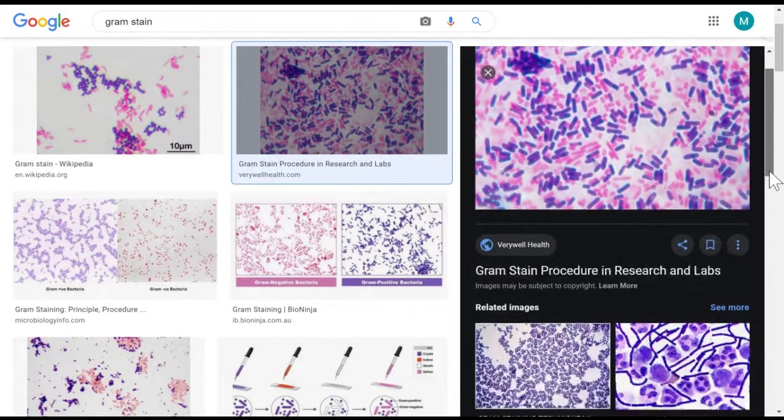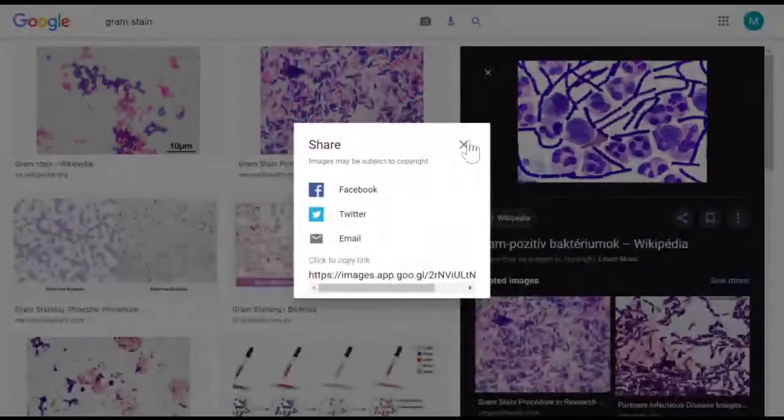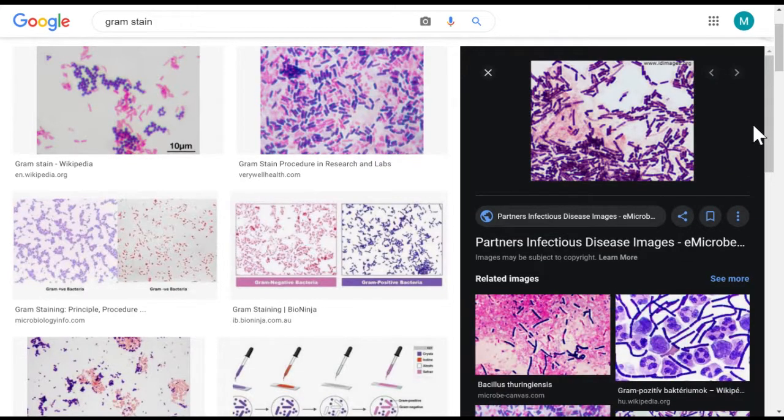Let me show you a chain arrangement right here. Take a look at these guys. These are definite chains. These are Gram positive. This is an actual specimen from a human because you can see the white blood cells there. But you can see here Gram positive rods in chains. So that's Gram positive rods in chains, all surrounded with white blood cells, but forget the white blood cells. Here's another Gram positive. And this is a bad slide in the sense that there are so many cells. It's a little bit hard to see, but these also look like they are chains all around. So that is a chain Gram positive.